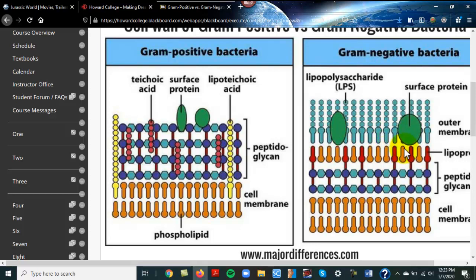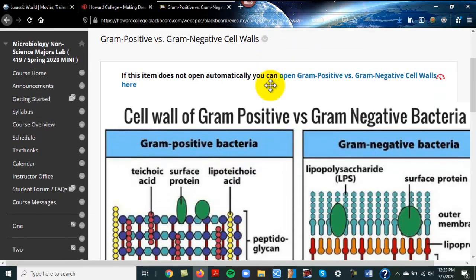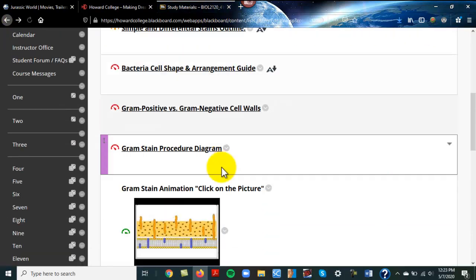And so what ends up happening during gram staining is you start out with crystal violet, which is purple, you add iodine, and then the decolorizer part will wash out all the purple because it destroys this outer layer because it's made of lipids and some sugar. Well, and starch, polysaccharide. And then what happens is that last step when you add a counter stain, the red goes inside the cell, and gram negatives will stain red color, whereas gram positives, they stain a purple blue color. It's a very simple process, and that way you can easily put something into categories right away.